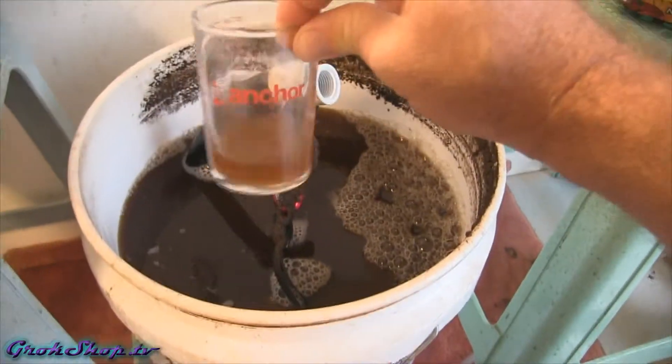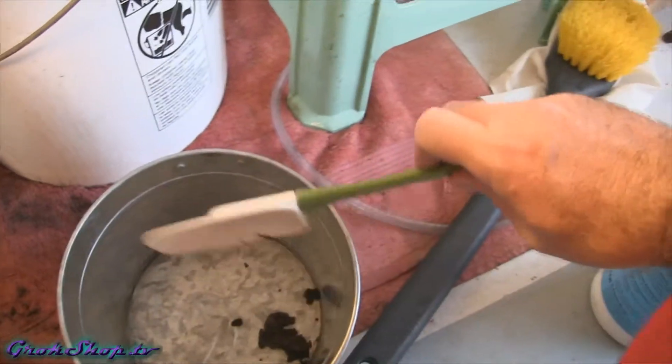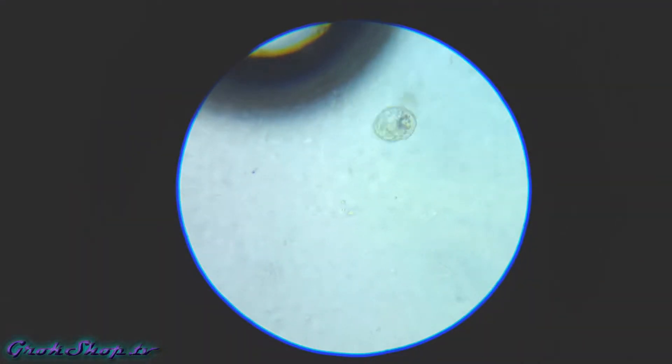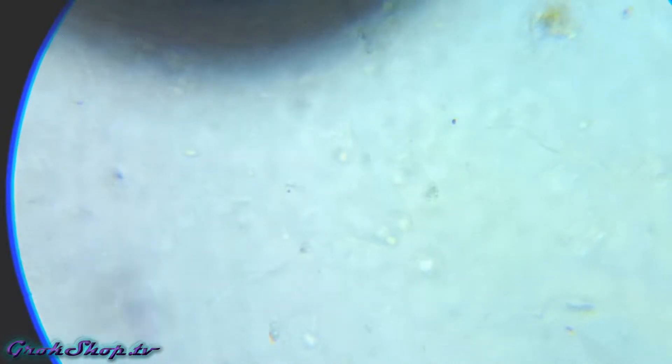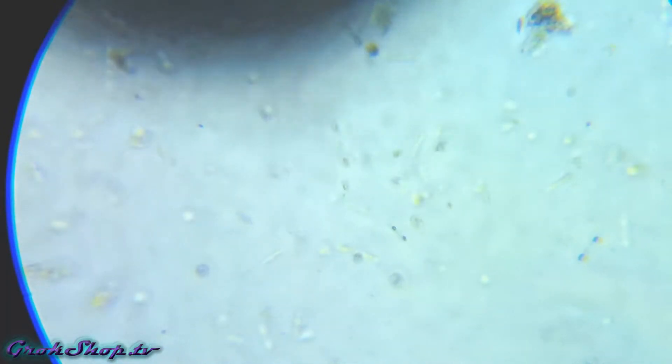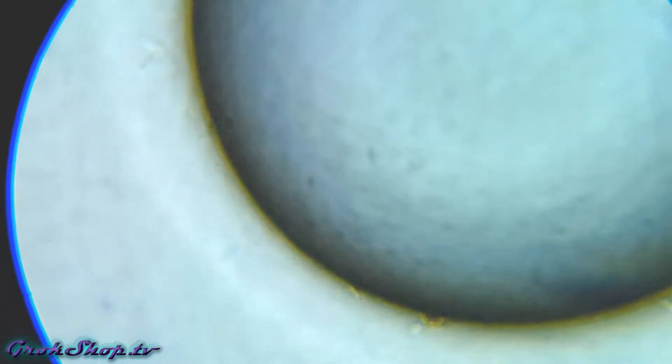Okay, 36 hours later the brew's done. Grab a little sample for the assay and scrape off some residual compost and send it back to the compost heap. Pretty quick here we can see there's definitely quite a bit of bacteria, flagellates, and some ciliates running around. There's definitely quite a bit of biodiversity - much more so than the first brew in part four of the series. This is almost certainly due to the fact we've provided food for the bacteria to grow; growing bacteria provides food for other organisms.